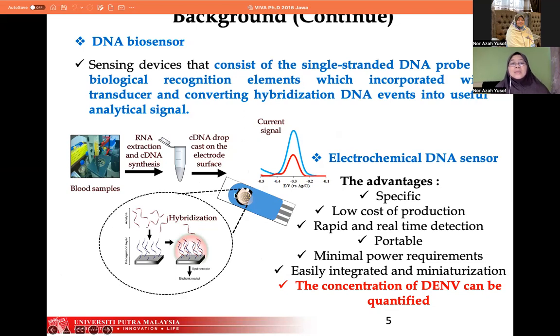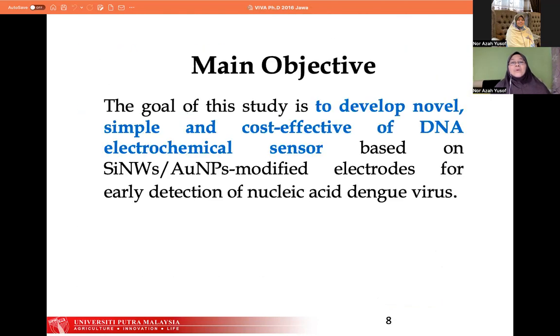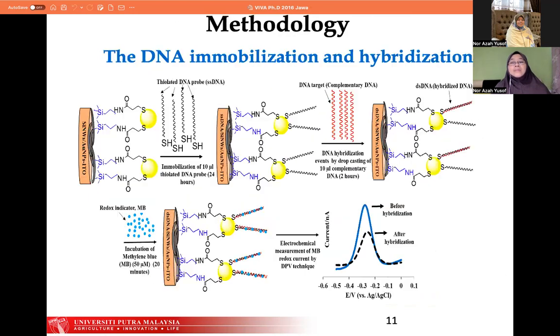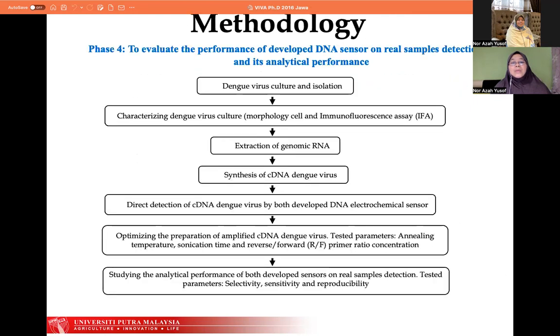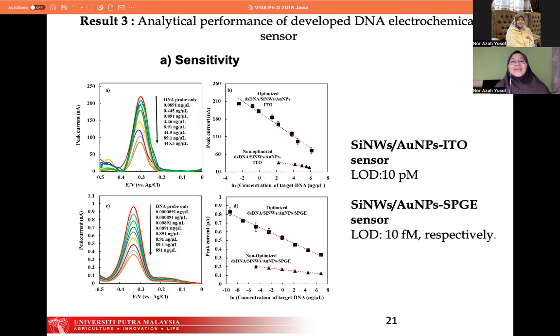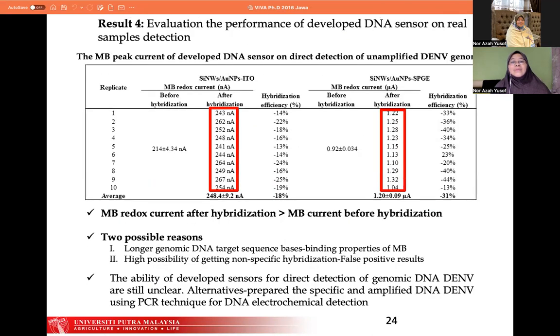So you can see that once we have the sample ready, it is deposited, it is introduced onto an electrode, and then based on the hybridization, we can conclude whether it is dengue positive or it is not dengue positive. It is negative. So I'm not going to show all this, but this is just to show you that there are some works that we have to do. These are the amount of work that we have to do, so it's not as easy as you can think of.